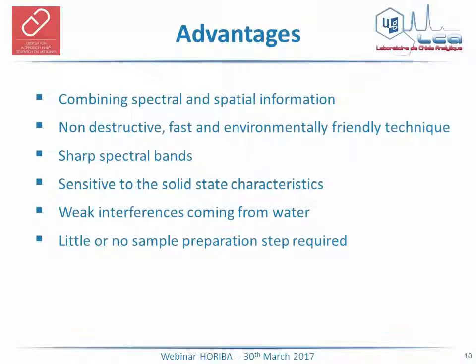Raman hyperspectral imaging has numerous advantages, among which the following are noteworthy. This analytical technique enables to acquire spectral and spatial information at the same time. It is a green and non-destructive technique having a fast data acquisition. A Raman spectrum contains sharp spectral bands and is sensitive to the solid-state characteristics. Compared to infrared, the presence of water does not hinder its applicability, because water is a weak Raman scatterer. And the last one, the examination of a wide diversity of samples, including semi-solid, mixture, liquid, or suspension, is possible with a minimal sample preparation step.